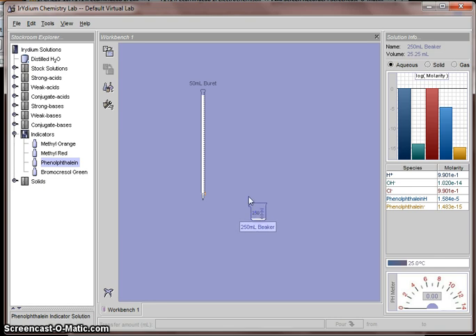We took 1 molar solution and we transferred 25 ml of it in here. So we can easily calculate how many moles of HCl are in this flask. Correct? If there is 1 mole in 1000 milliliter of solution, then how much is there in 25 milliliter of solution? So basically 25 divided by 1000 and we get 0.025 moles. Yeah, because it's a 1 molar solution, so 0.025 moles is in there.